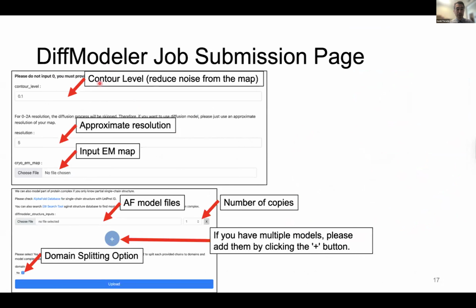So you can specify the contour level here, then put the approximate resolution number, then input your EM map. Then here, you can upload the AlphaFold models. If you have multiple AlphaFold models, please add multiple models here. Here you can upload the AlphaFold model and also specify the number of copies. If you have another AlphaFold model, please click this plus icon, then put in the information for the additional AlphaFold model. It's very simple to use.